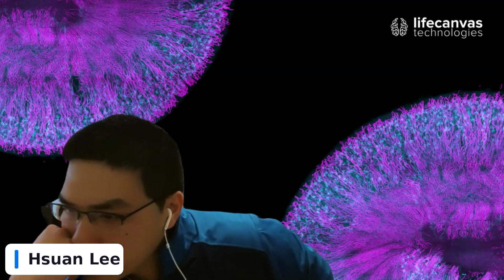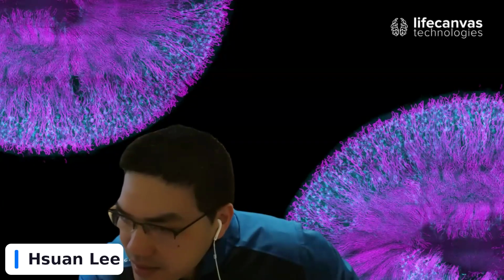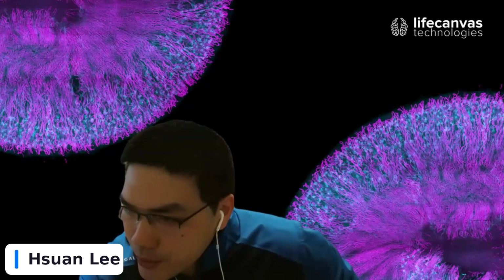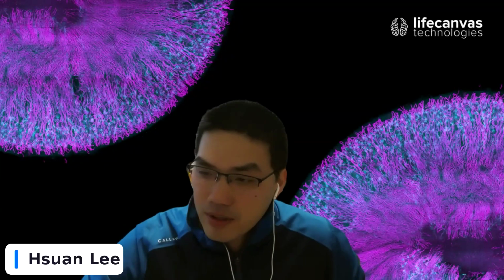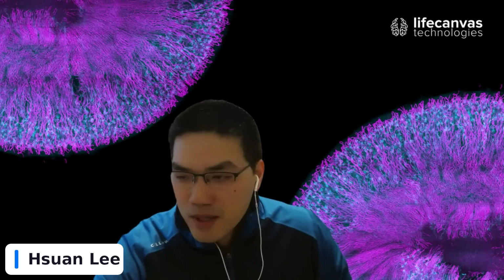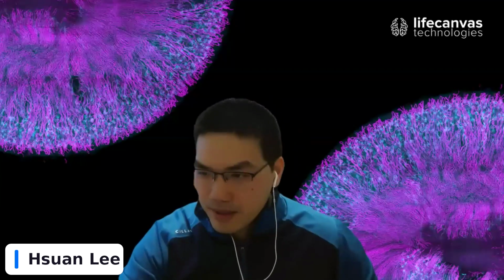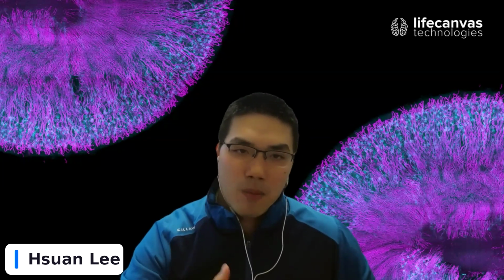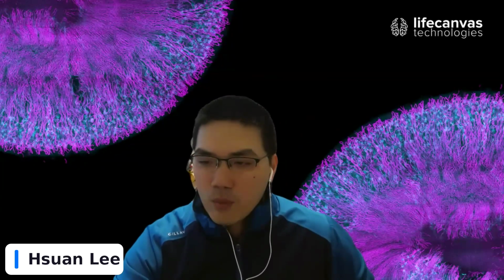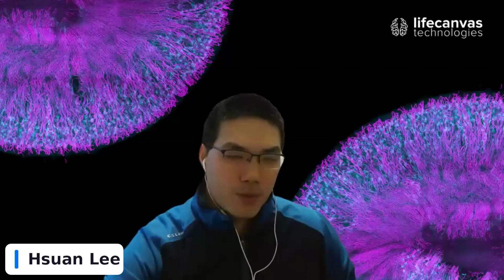And I got another question from Laurel Schruck. Does DALISPIM require EasyIndex, refractive index 1.52, for immersion, or can you change the immersion media to be compatible with other clearing methods? That's a great question. So for now, we focus a lot more on the compatibility of the DALISPIM with EasyIndex, refractive index 1.52, and we're working on making it work for other immersion media as well.